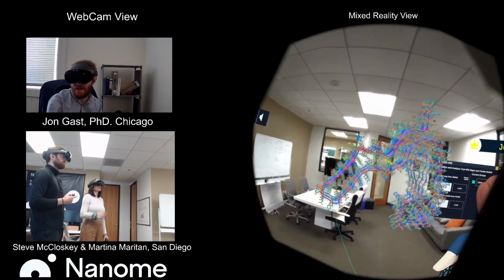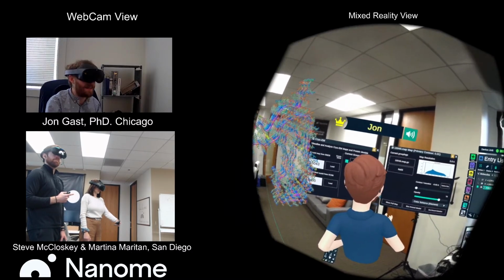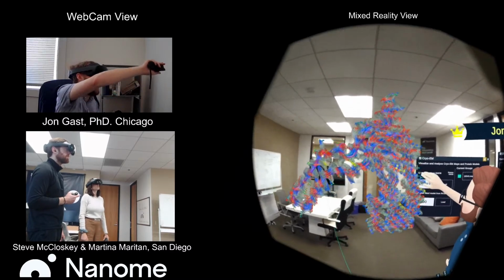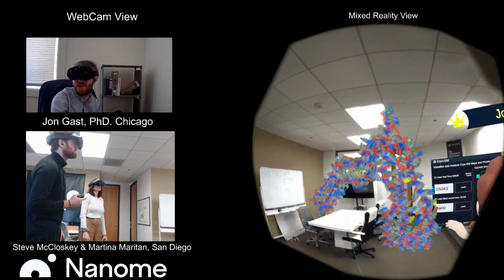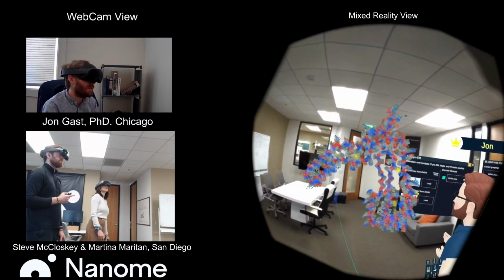But once again, at other times, I'm going to be much more interested in going up to maybe like 70 or so, just to see how good the fit is. And this is actually a pretty good resolution. We can see 2.6 angstroms, pretty good one.